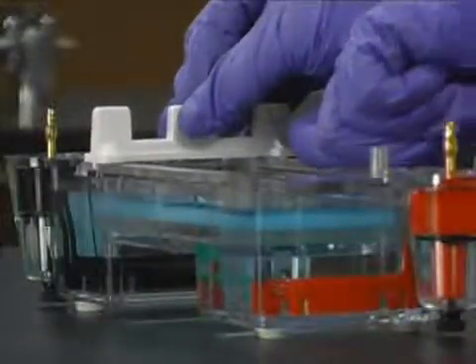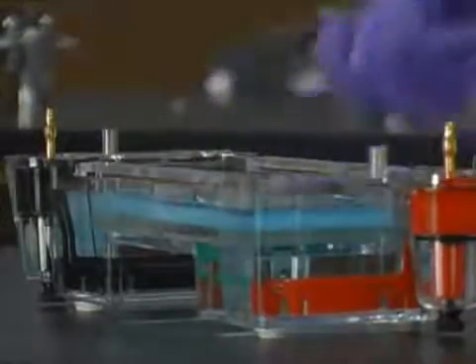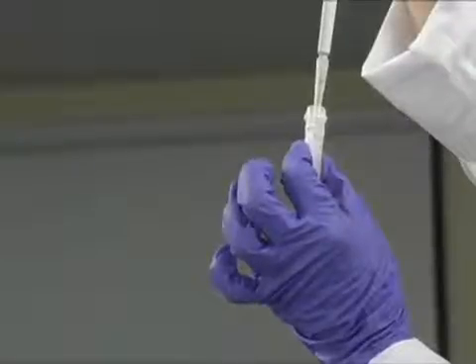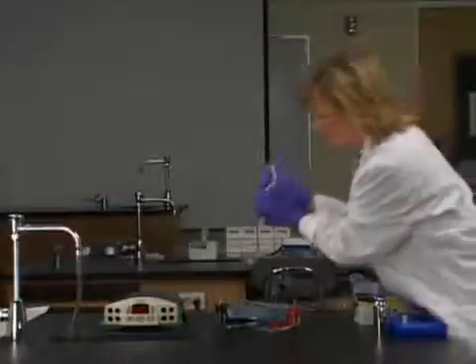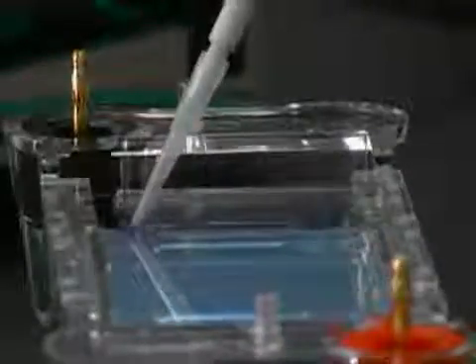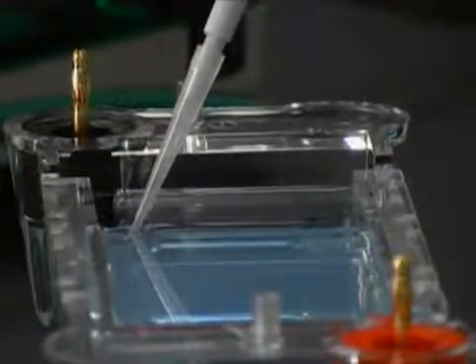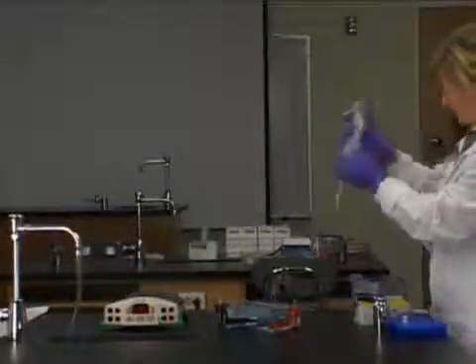Make sure that you're anchoring, holding down the mold. We're going to take this comb out. This is our DNA standard, or ladder, and I'm putting in 10 microliters of ladder. Excellent. Here we go. There's the well. Nice and slow into the well and down into the second stop. There. And release the micropipette plunger.